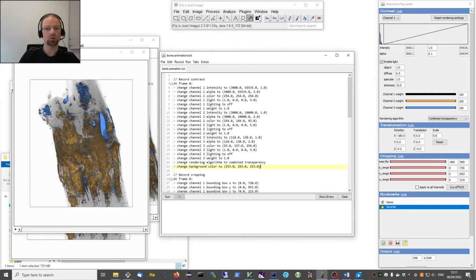Also, just think like you are doing an experiment. You have maybe different conditions or different repeats. You have a number of images which were taken, acquired with the same settings, and you want now to compare them, maybe look out for a phenotype. And so you would like just all of these images to be rendered with the very same settings. And now, since you have the script, you can just open the next image, open 3Dscript again, and just load the text. You don't need to do any adjustments, just load this text and run it again. So I think that's really, in my eyes, the key feature of it.